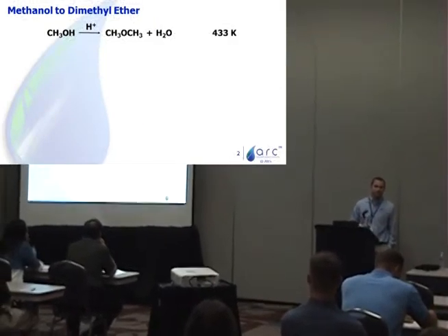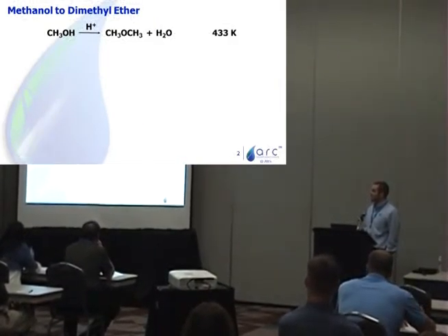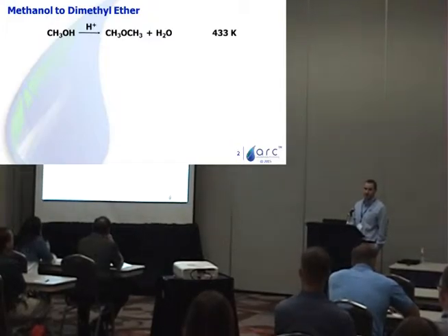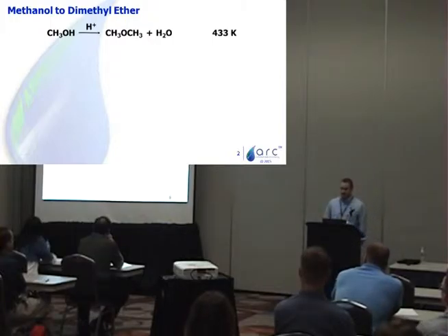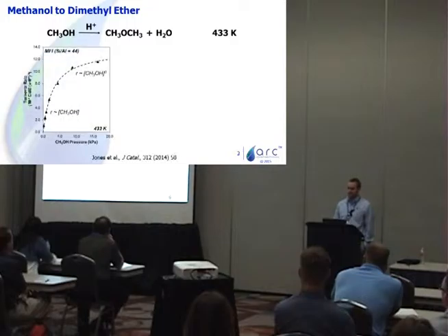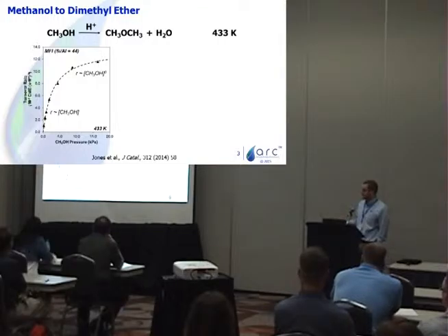Now, the motivation for this technology begins back when I was a graduate student at the University of California, Berkeley, and I was looking at methanol dehydration to dimethyl ether on solid acid catalysts. In order to measure the kinetics of this methanol dehydration to dimethyl ether, which I'm showing here as the turnover rate as a function of the methanol pressure, I had to be able to accurately measure the concentrations of methanol and dimethyl ether.